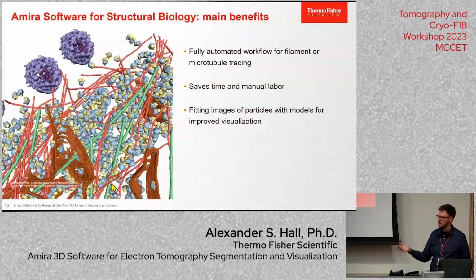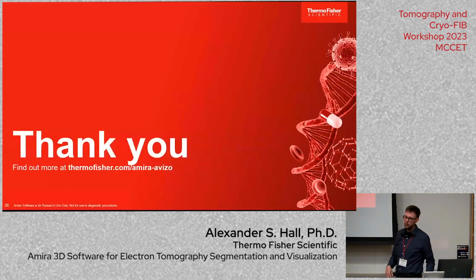I don't want to go back through the slides, but we have an image correlation based method for tracing tube-like structures, which I would recommend instead of deep learning, because I think it's a better fit for that problem. And you can mix and match these things, so you don't have to do one or the other.